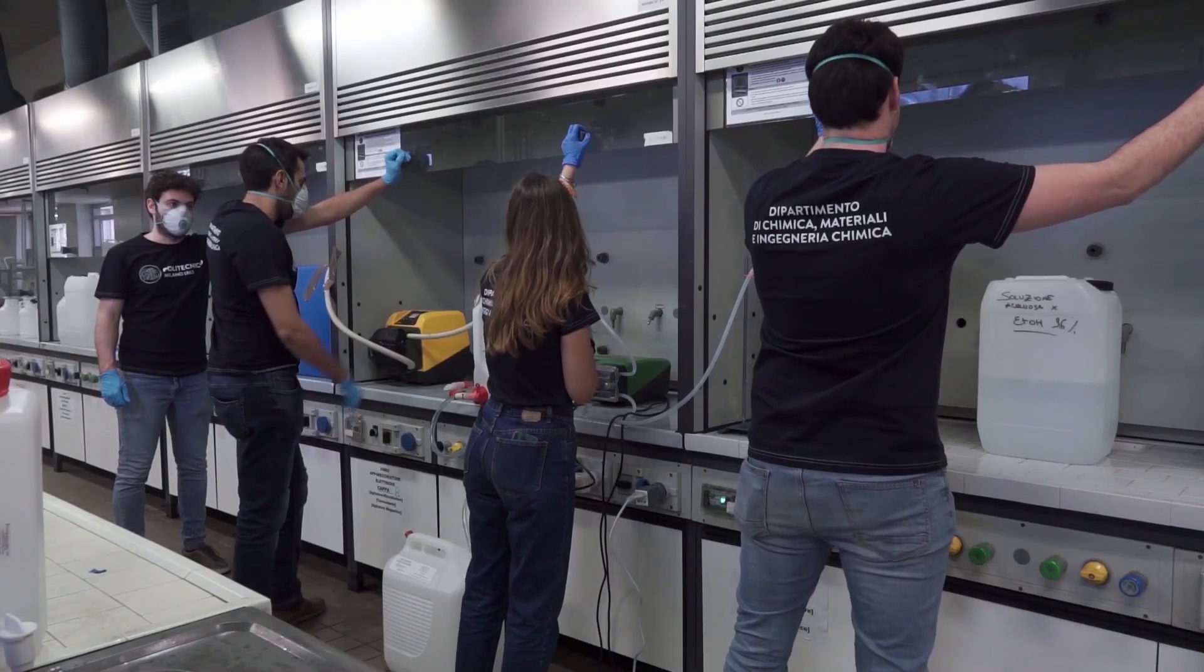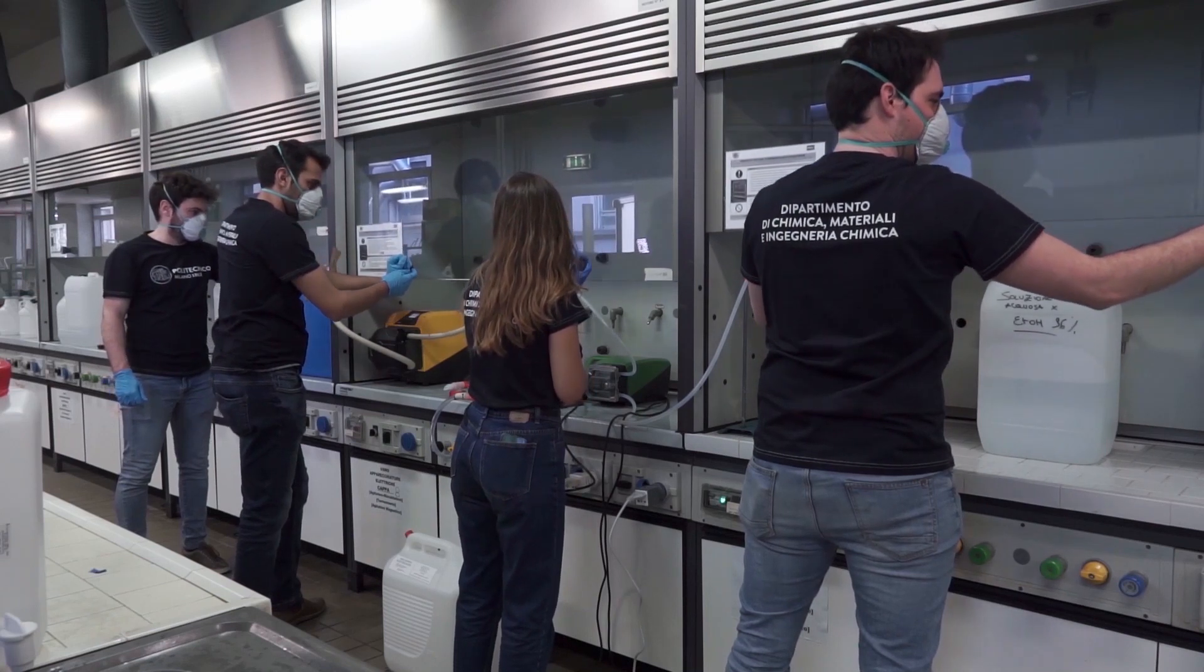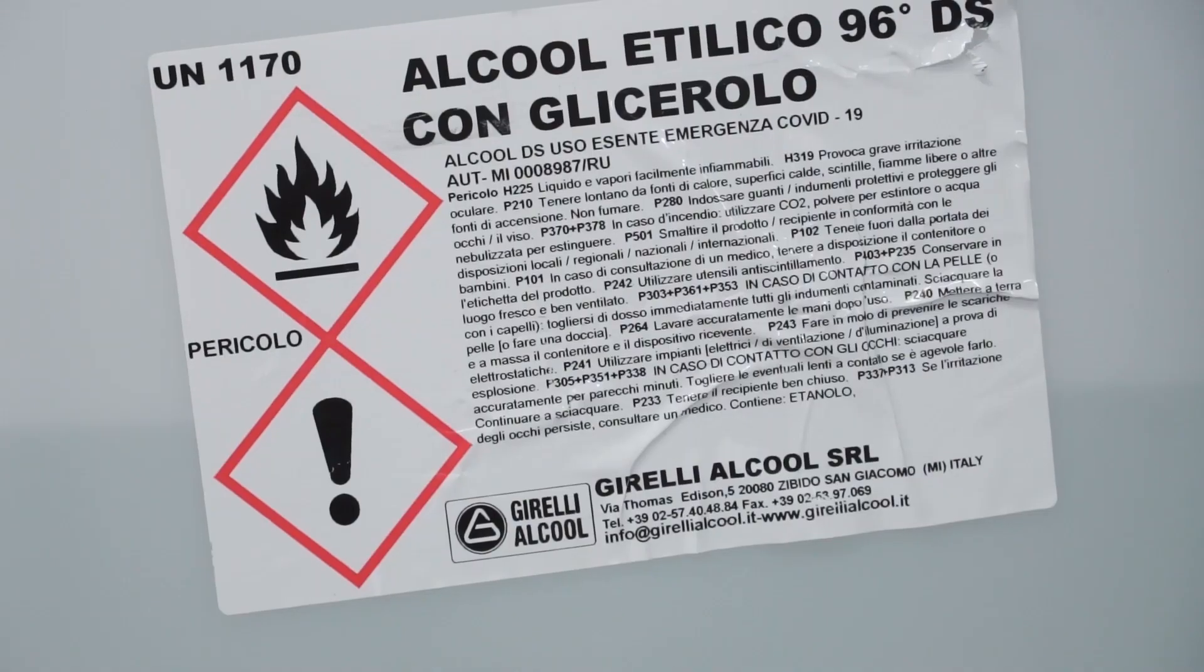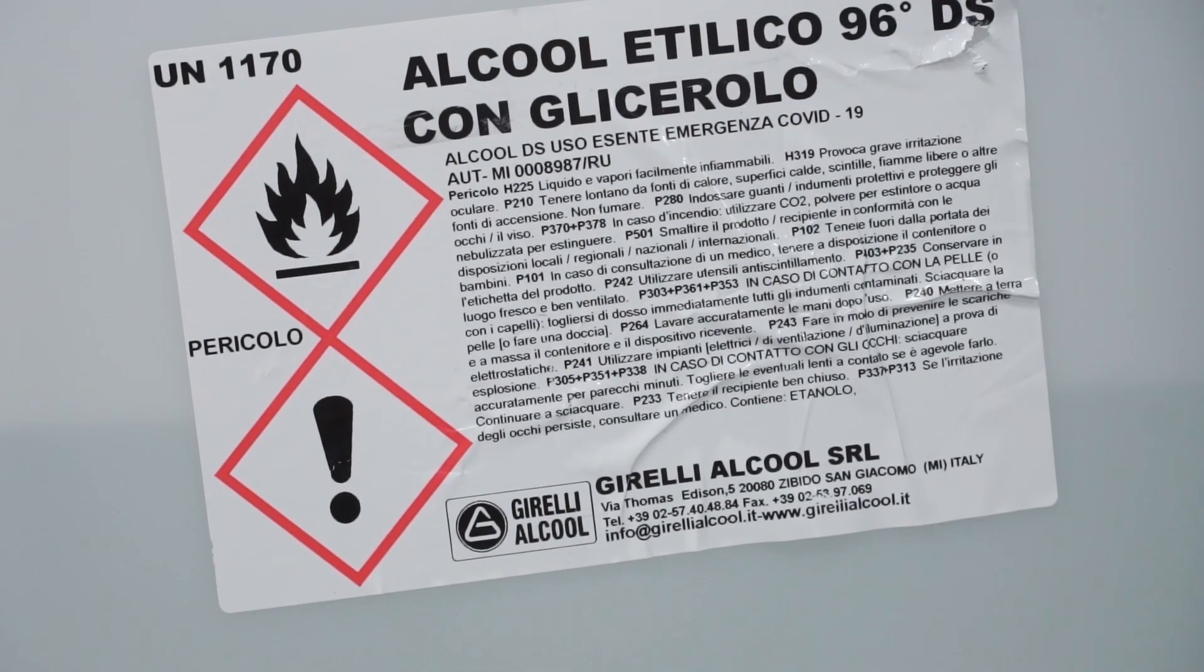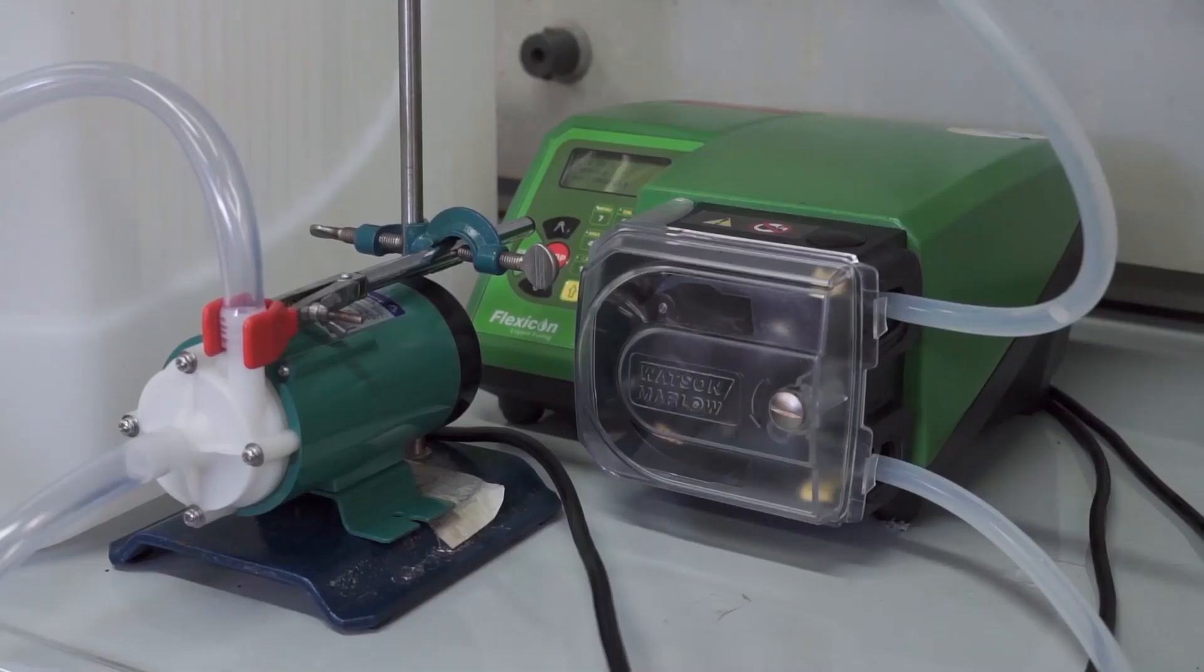To work safely, all the instruments described must be placed under a chemical fume hood or outdoors in a well-ventilated environment. Particular attention should also be paid to the explosiveness of alcohol vapors. For this reason, we recommend the use of peristaltic pumps in order to avoid direct contact of the alcohol vapors with electrical sources and moving mechanical parts.